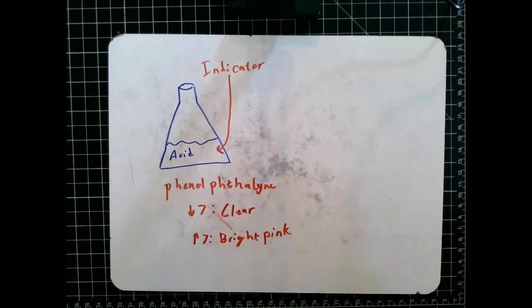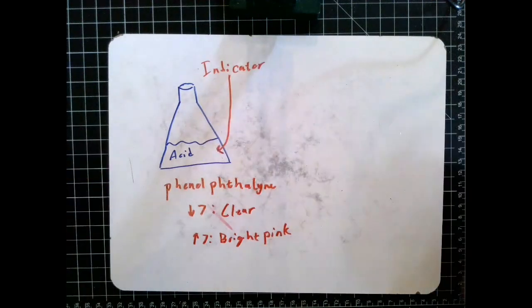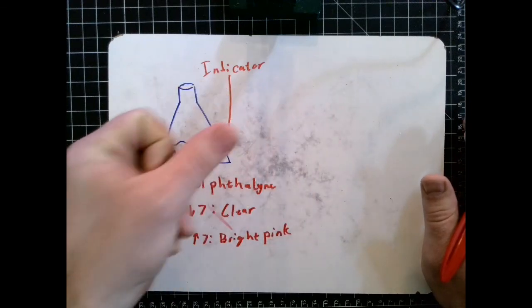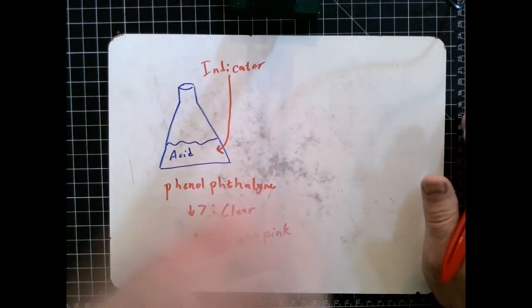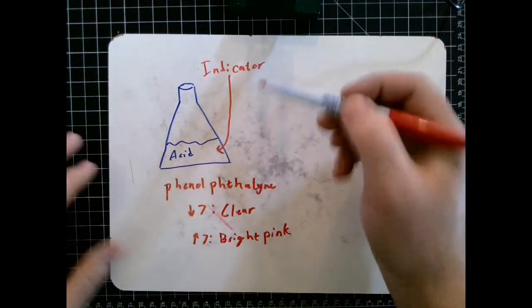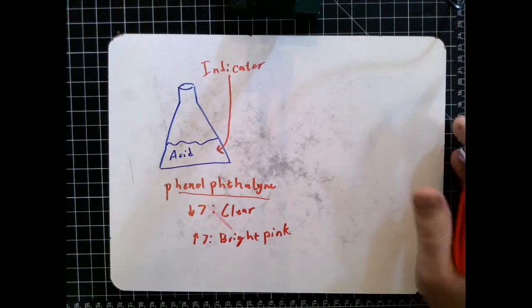And so we're able to use a substance like that. And when we change the pH in here, as soon as it fully neutralizes, it will shift like that. The color will suddenly change completely throughout the whole solution. It's actually really cool to see. So once we've got that indicator in there, we'd use phenolphthalein, and I'm going to go through an actual titration on video and send it to you guys so you can see what it looks like.